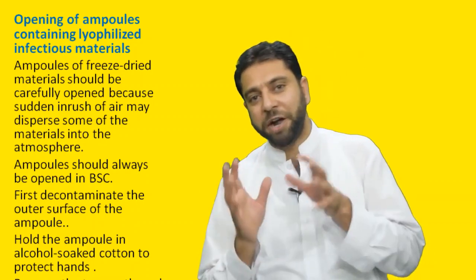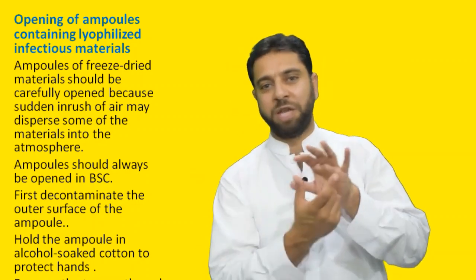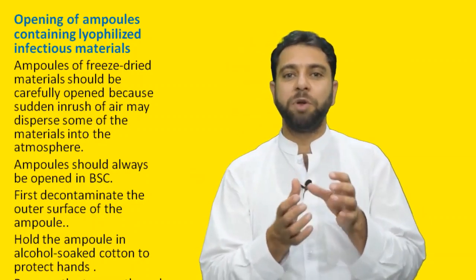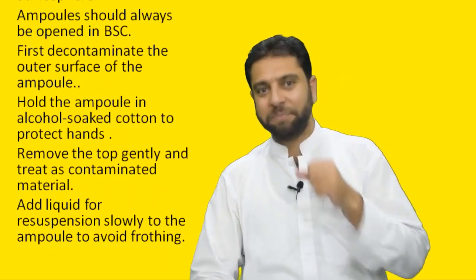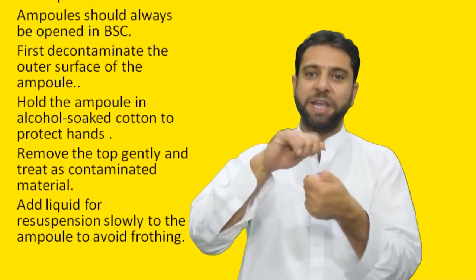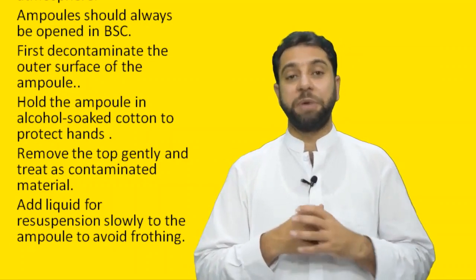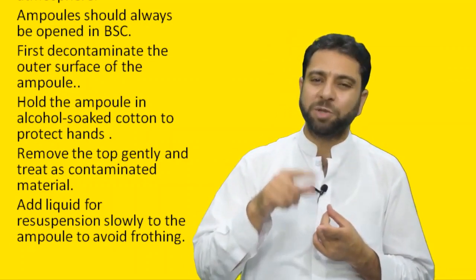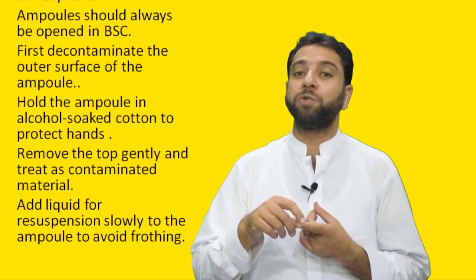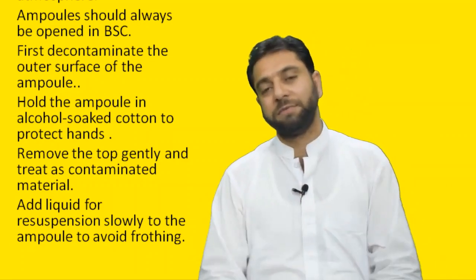First, decontaminate the outer surface of the ampoule, then hold the ampoule in alcohol-soaked cotton to protect hands. Remove the top gently and treat as contaminated material. Add liquid to the ampoule very slowly for resuspension to avoid frothing.